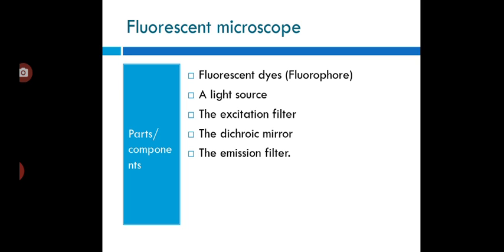Many fluorescent stains have been designed for a range of biological molecules. Some of these are small molecules that are intrinsically fluorescent and bind a biological molecule of interest. Major examples of these are nucleic acid stains like DAPI and Hoechst, and phalloidin, which is used to stain actin fibers in mammalian cells.